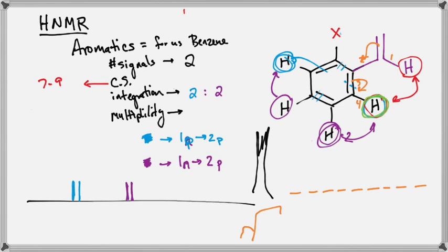Okay? Does it change the chemical shift? No. So using a stronger magnet has no effect on the chemical shift, which is a dang good thing, because if it changed the chemical shift, you would then have to also report what magnet you're using for every single one of your spectra, and you'd have different chemical shift ranges you would have to memorize for each magnet. That would suck. Okay? So since that's now standardized, there's a way to calculate.